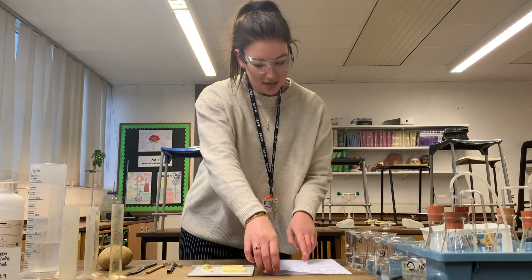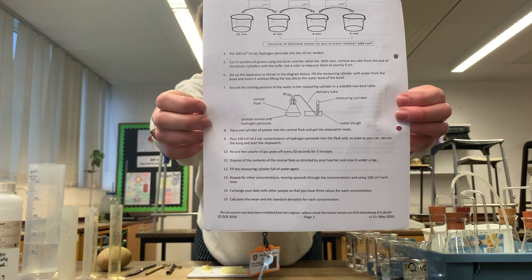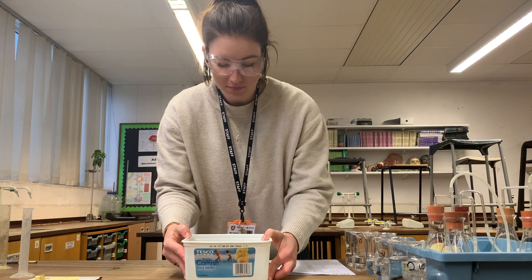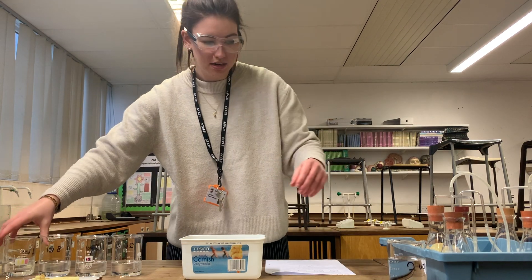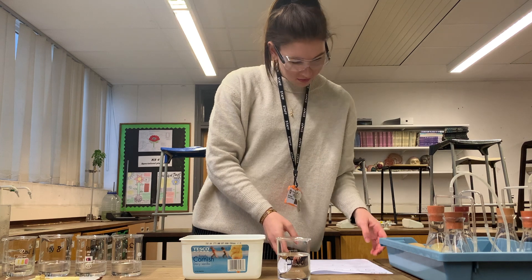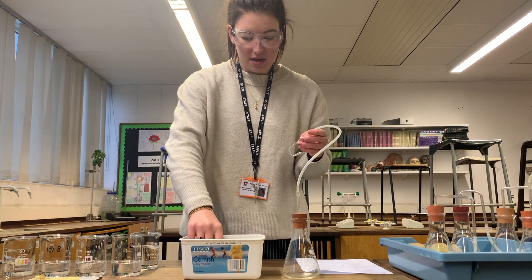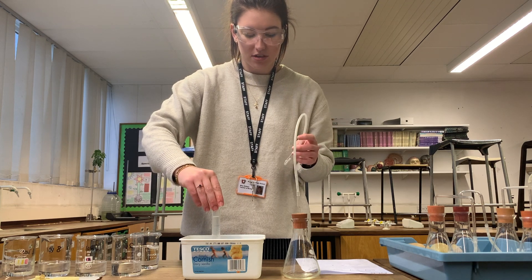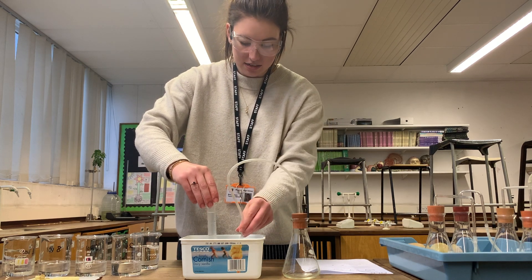Set up the apparatus as shown in the diagram below. The tub is filled to about here with water so that I will be able to get the measuring cylinder completely submerged underneath. We are starting with our 2 vol. I have filled up the measuring cylinder with water and now I lift it up this way round so that the end of the measuring cylinder has not come out of the water, and then I can hook this end underneath.